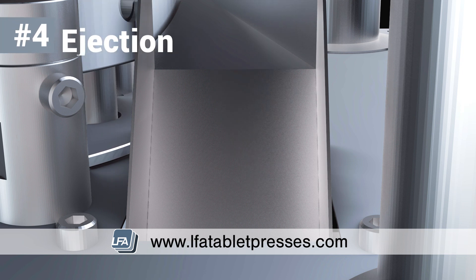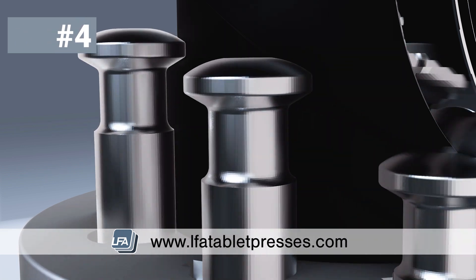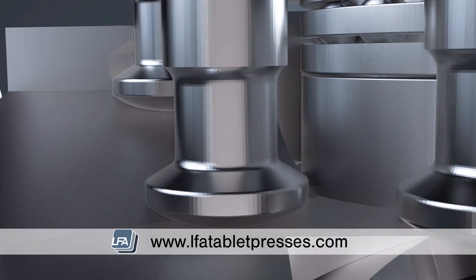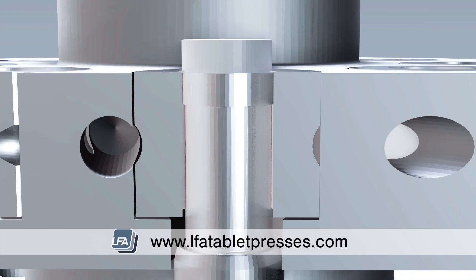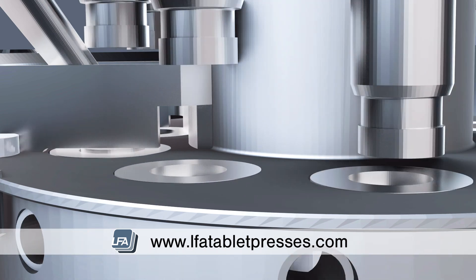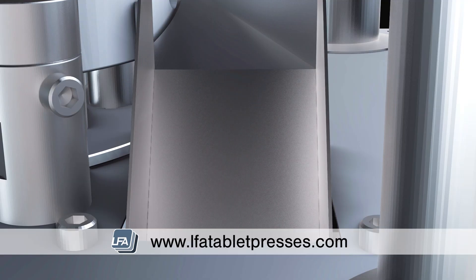Ejection. Once your tablet has been formed inside the die, the upper punch is lifted out of the die bore by the upper tracking, whilst the lower punch will go over the ejection cam. The lower punch is raised in the die bore until it's flush with the die. This pushes the tablet out of the die and flush with the die table. The table then rotates and pushes the tablet into a scraper, often known as the takeoff scraper, which moves the formed tablet down the ejection tray into a container or the next stage of the process.